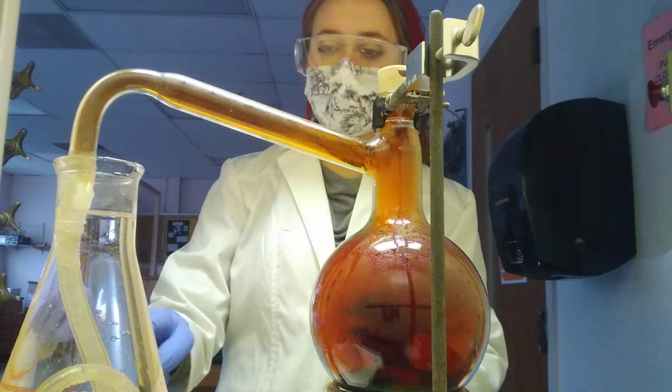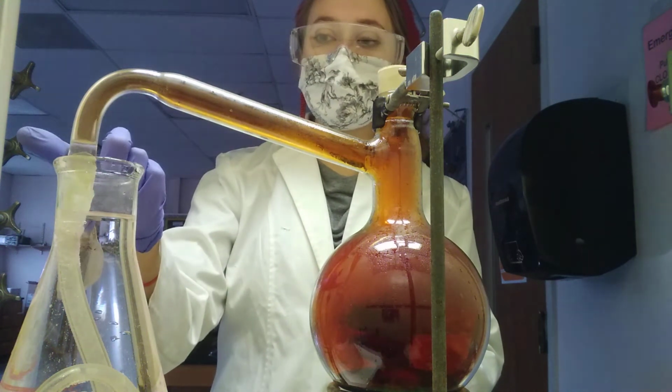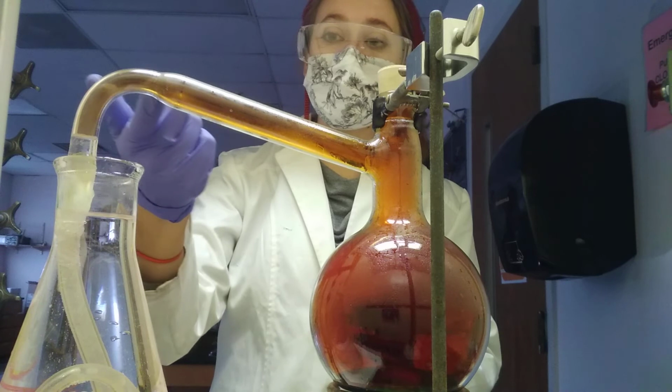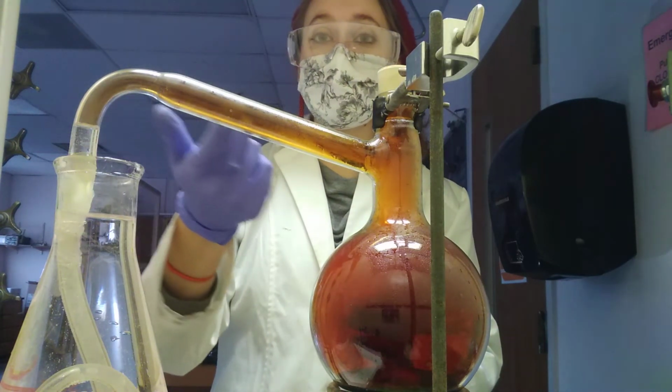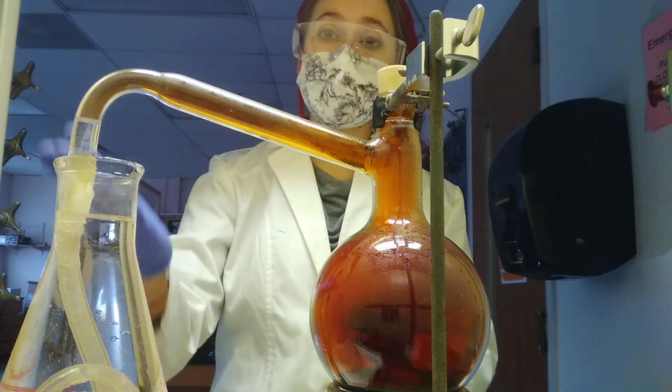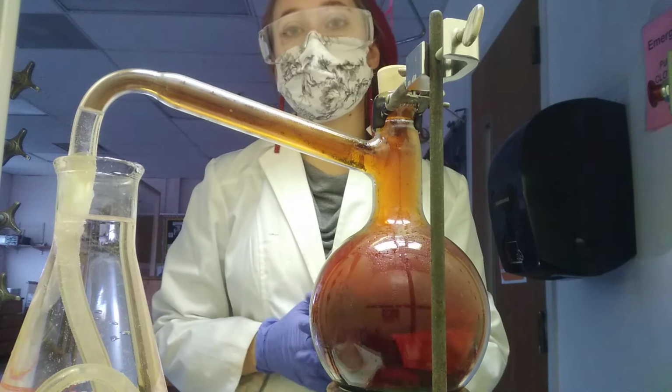What you may have noticed in this tube in particular, and now in this glass tube, is that it is the water itself that is climbing up. It's not that there's air pushing this NO2, it is the water that is pushing it. So what is pushing on the water to make it go back into the round bottom flask?